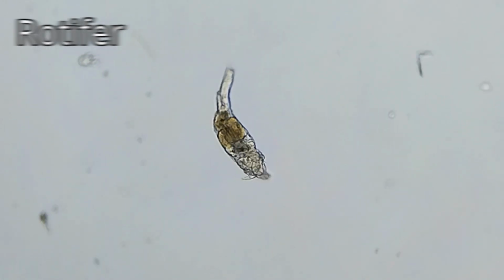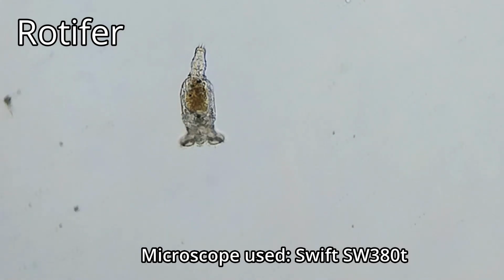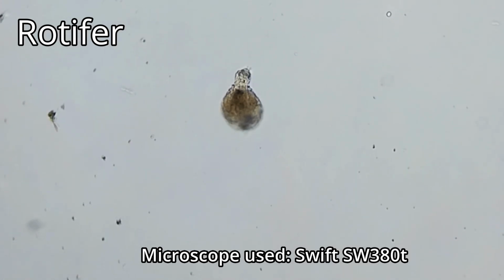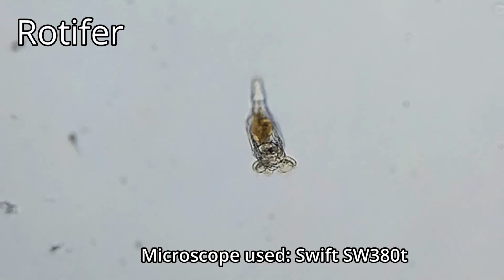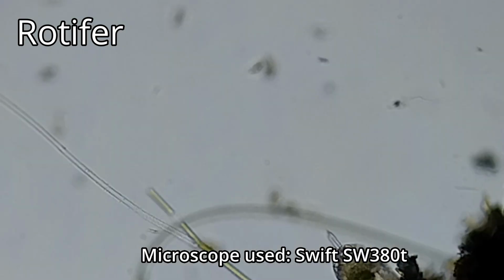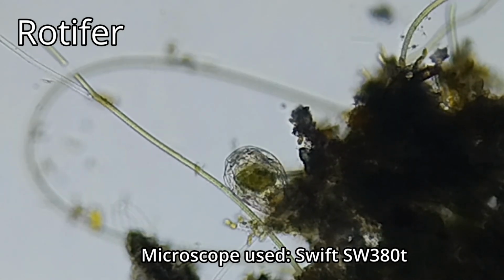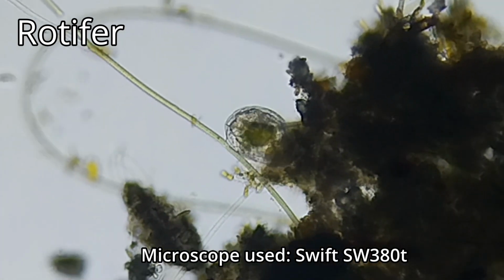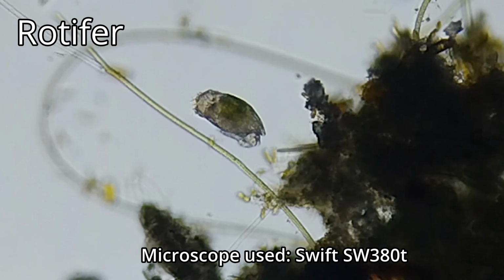We can also observe much smaller organisms, including this rotifer. Rotifers are microanimals, meaning they are multicellular organisms, but they are smaller than the other animals shown in this video so far. This is another rotifer. It looks very different because, unlike the previous rotifer, which belongs to the class Bdelloidea, this one belongs to the class Monogononta.